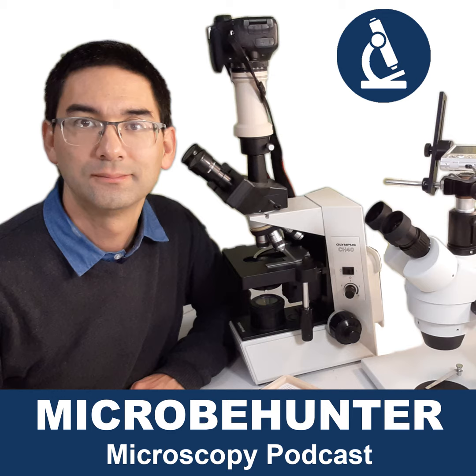So a stereo microscope can be compared a little bit to a magnifying glass that magnifies a lot. And the second thing is that stereo microscopes, as the name already implies, give you a three-dimensional view of the magnified image. It's a little bit like binoculars.